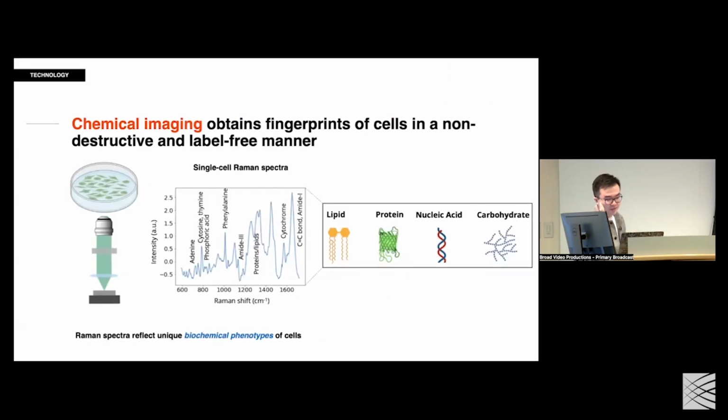But what is Raman microscopy? What is chemical imaging? At least this is not an imaging method that we would usually see in a single-cell sequencing talk. A chemical imaging method is a new category of imaging methods, and Raman is just one type of chemical imaging method. What Raman does is measure the chemical vibration inside a cell. Each molecule has a different vibrational frequency. You shoot a laser at the sample, the different molecules are vibrating, and the light will be scattered in a different way.